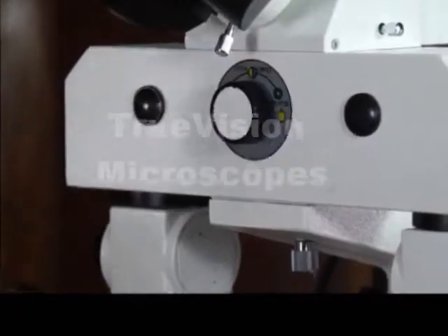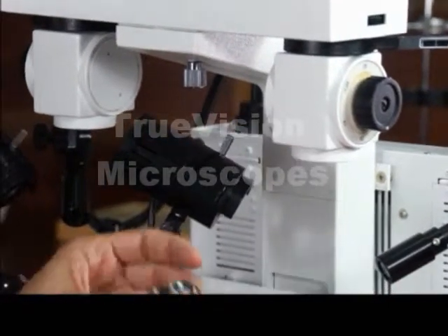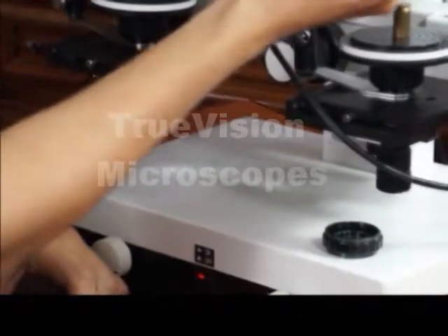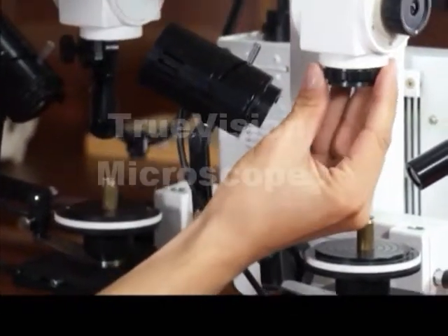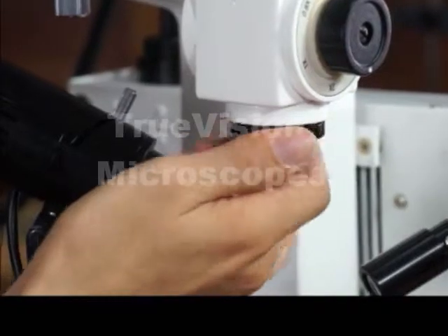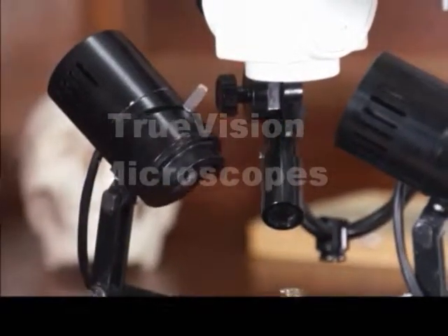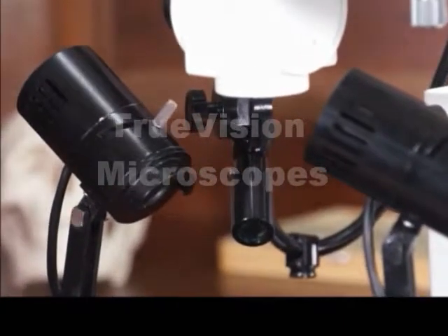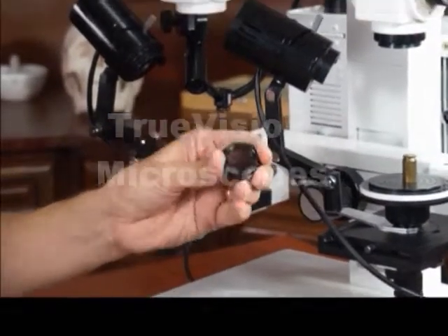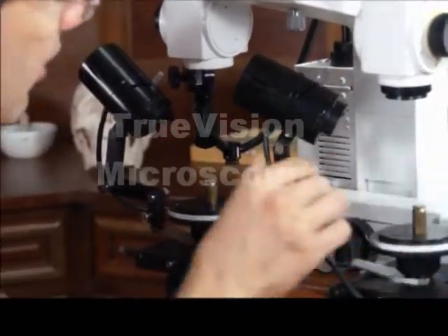We have a variety of accessories. These are polarizing filters. This is considered an analyzer — it is a polarizing filter. You would put one on each side. A lot of times when you're looking at evidence that is very bright, you may need to see those scratches in greater contrast. That's when a polarizing filter may come in handy.